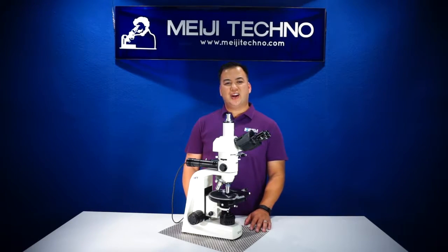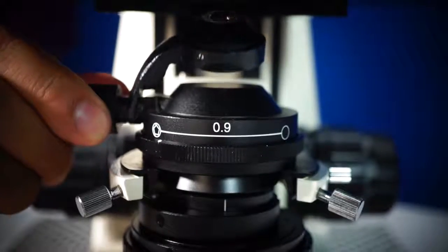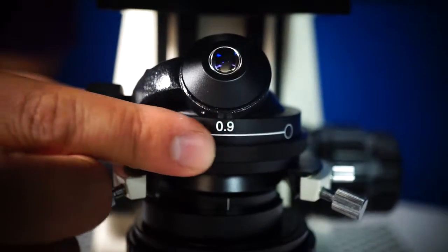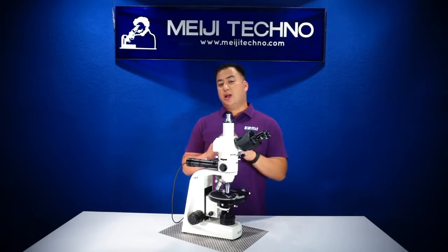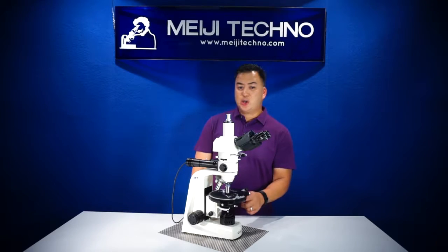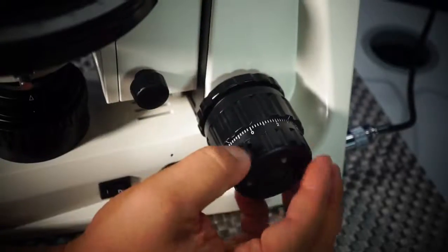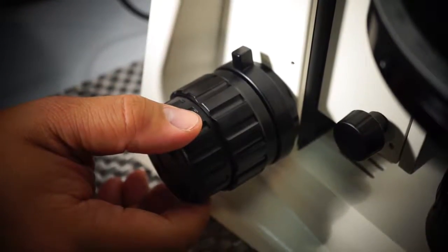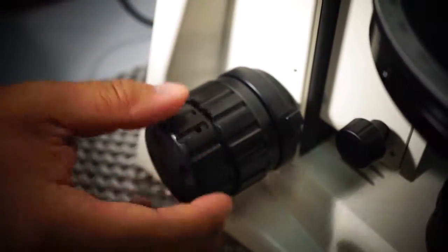Below the stage, the MT9900 has a centrable strain-free Abbe condenser with a built-in iris diaphragm and a flip-top lens, which helps fill the field of view with low-power objectives — all set up in a dovetail mount. Coaxial coarse and fine focus controls with a built-in stage lock prevent users from breaking slides once engaged.